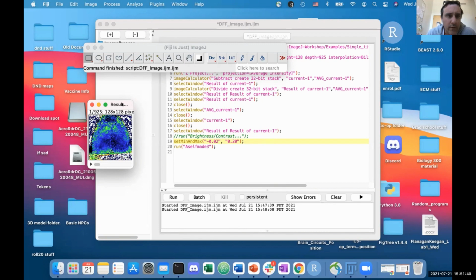But in general, if you have some steps that you want to do, you can do what Keegan has shown and record them in the macro, and then it's just more or less about the time saving involved. I mean, it takes quite a few clicks to do this process. You're going to get tired of it if you have hundreds of them to do. So that was the main utility in our case, was just speeding up the quality control on our data.